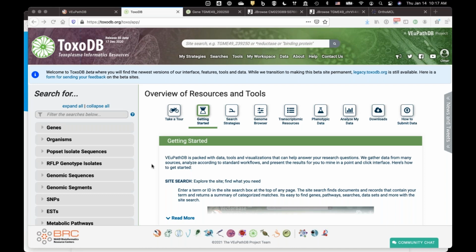And an important feature of VEuPathDB databases, in case you're not aware of this so far, is that we're not really a repository of the data. We are not the place where people store the data, but rather a place where scientists like you can come in and start asking questions across different data types. So a proteomics data set may be stored in PRIDE, which is a repository for proteomics data, and another RNA-seq data set may be stored in the SRA and in GenBank. But in VEuPathDB, you would be able to ask questions like, show me all the genes that are upregulated at this stage or that stage, and also have proteomics evidence from a particular experiment. And so that's a nice way where you can now leverage these search strategies that Gloria was showing you to combine the knowledge available on the various organisms and from the various data types.